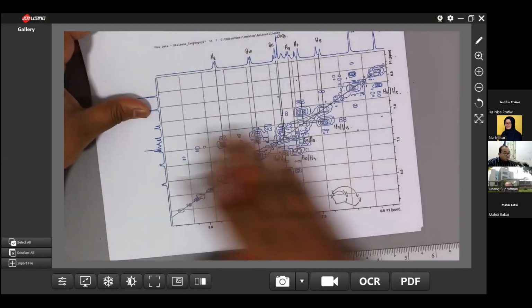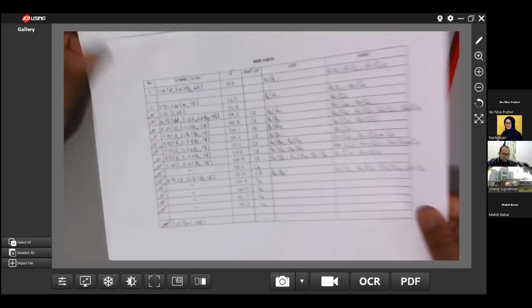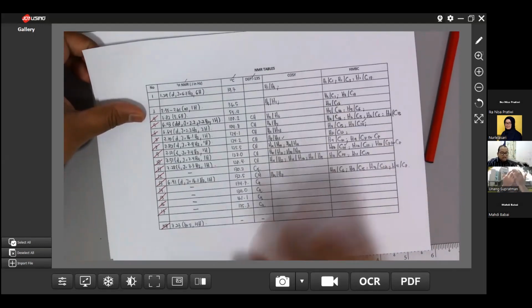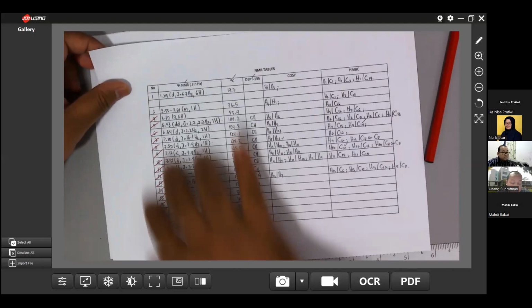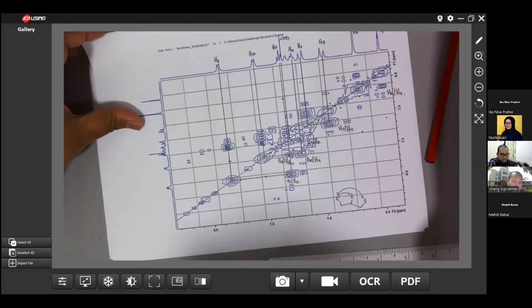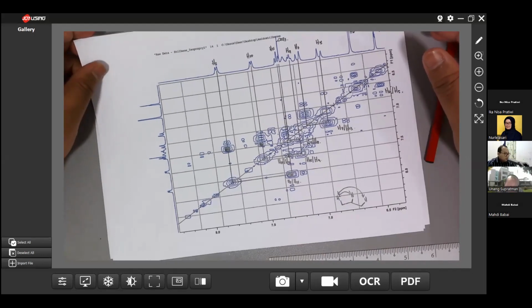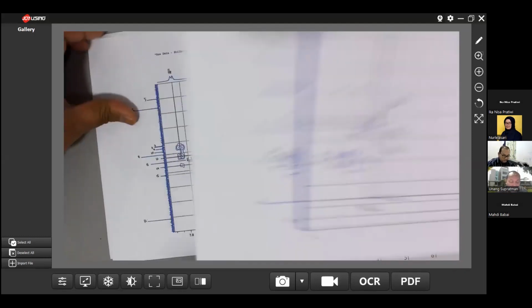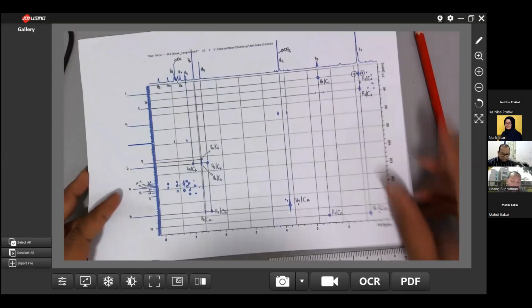So this is the COSY information. All the information is here, so what you can do is transfer all the information into this table for the COSY. In the end, you don't need to read all the spectra, but by using this information you can see the correlations. So the first one, COSY, is done. The last one we have to check is the HMBC correlations. Let me check how many spectra I got here.